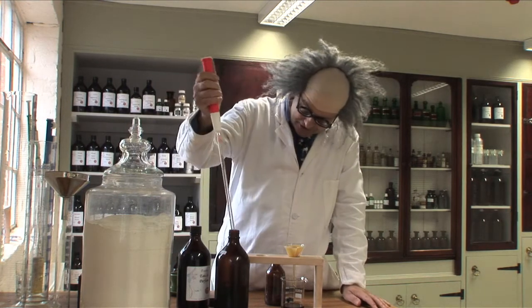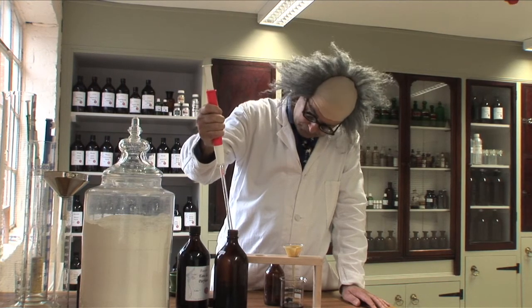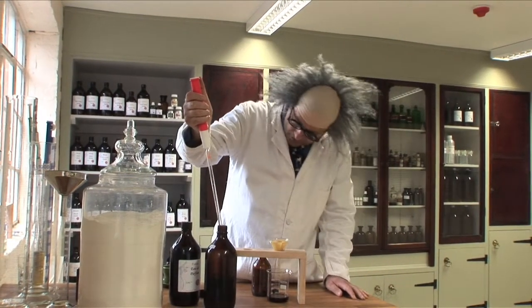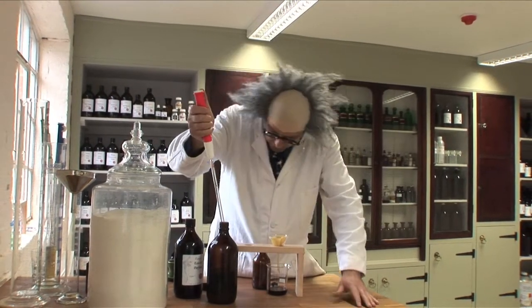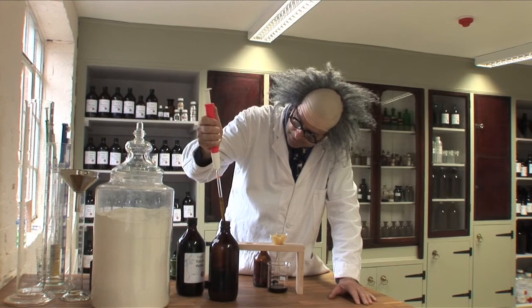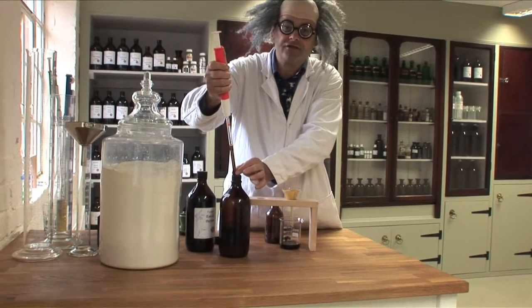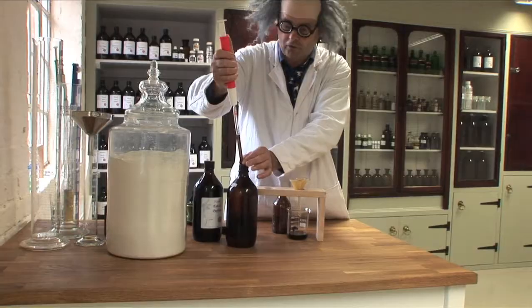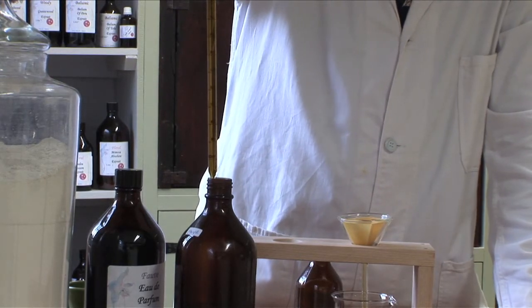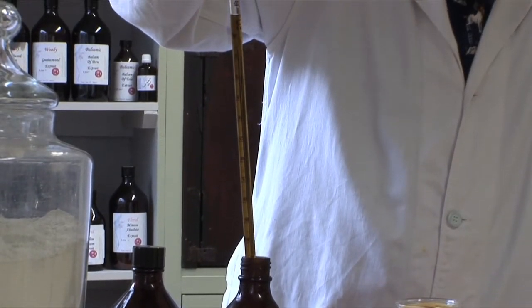One thing when using pipettes is that you don't want to stick the pipette too far into the liquid. Otherwise when you pull it out you've got a lot running down the outside, and if you're trying to measure accurately to put it into a small bottle you get all the stuff on the outside running down, which is waste and a mess. But you can see that's beautifully clear, and yet it was like a mud bath before it went into the fridge.